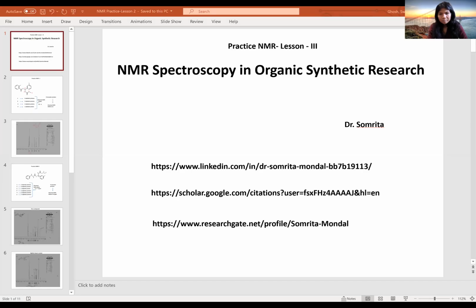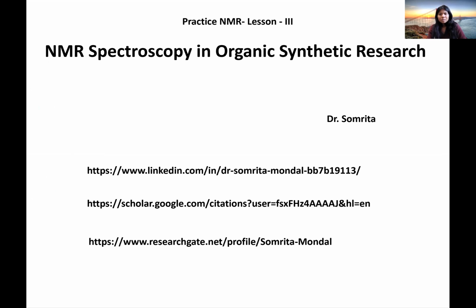Let me share the screen. So I hope you can see the screen now.